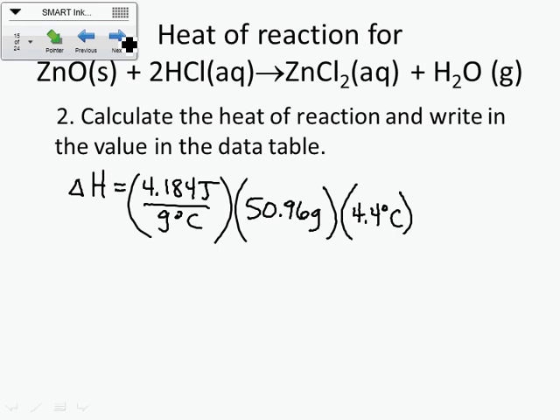No, on this one I guess it's just going to be 2, isn't it? Because of the temperature. So 940 here. But it's going to be negative 940 because this is exothermic once again, and this is joules. Okay, negative 940 joules. See how different that is than what they calculated.